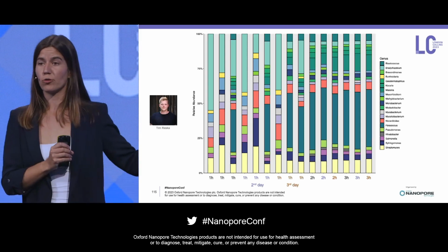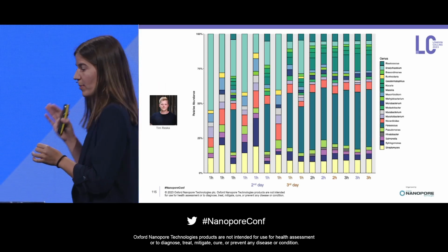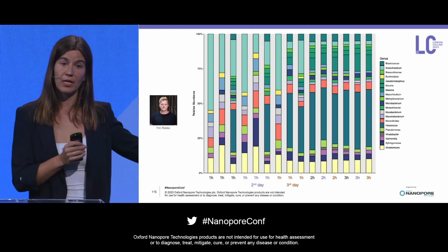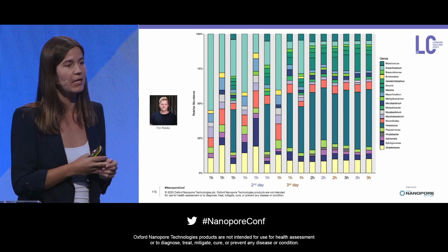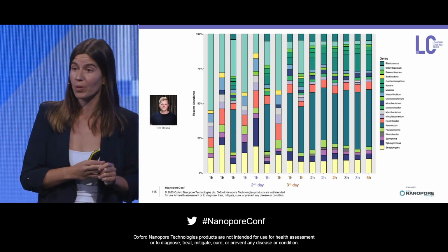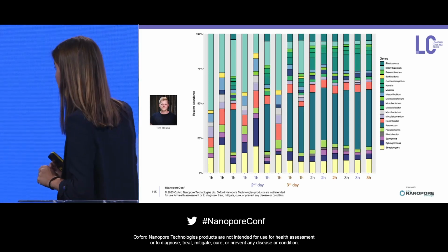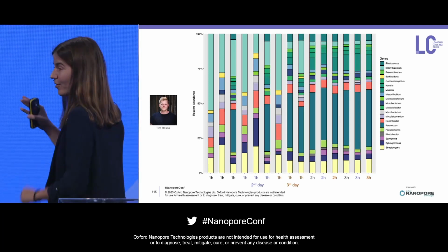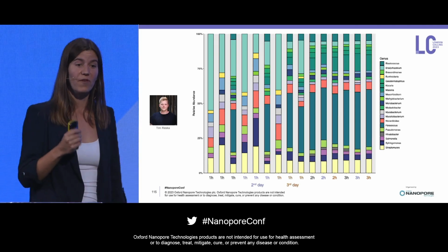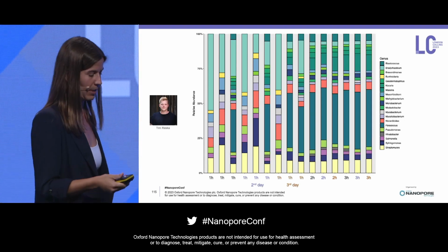So obviously this is a controlled environment, but it shows us that if we have a stable air microbiome, we can actually assess it just using shotgun nanopore sequencing. And I importantly have to say that we use the latest R10 chemistry for this, with the increased sequencing accuracy, but also the rapid barcoding kit actually really allows you to put tiny amounts of DNA in, which was really promising. And for the 2 hour and 3 hour samples, we are even able to build assemblies now, so do functional annotation of the air microbiome based on long-read data.